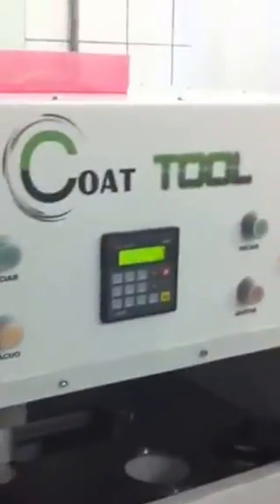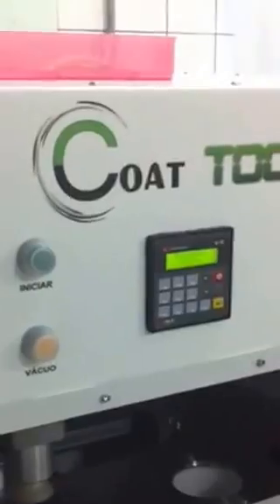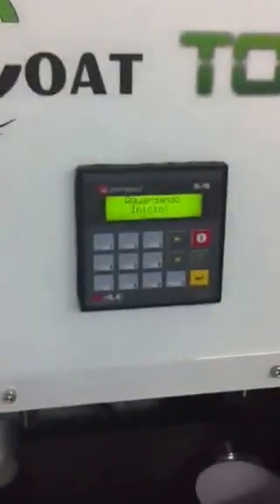I'm going to show the machine Coat Tool and how it works. Here is the panel. The first step is to put the lens.